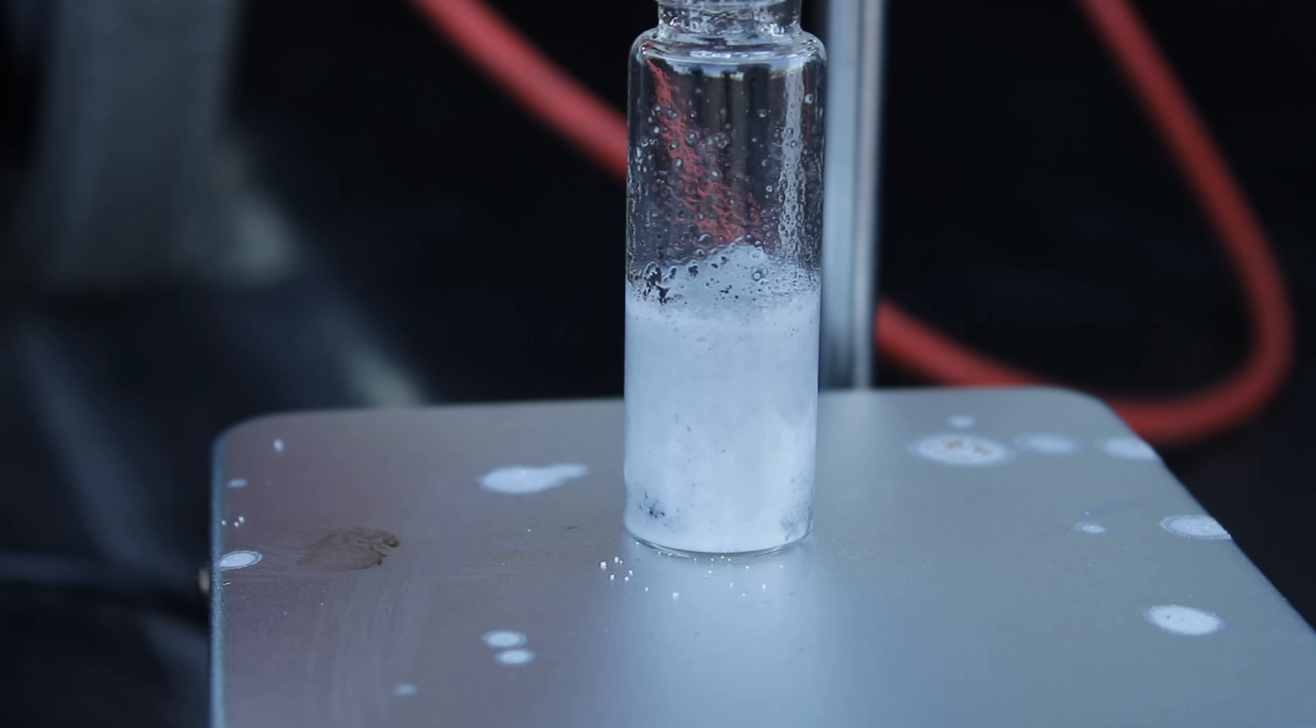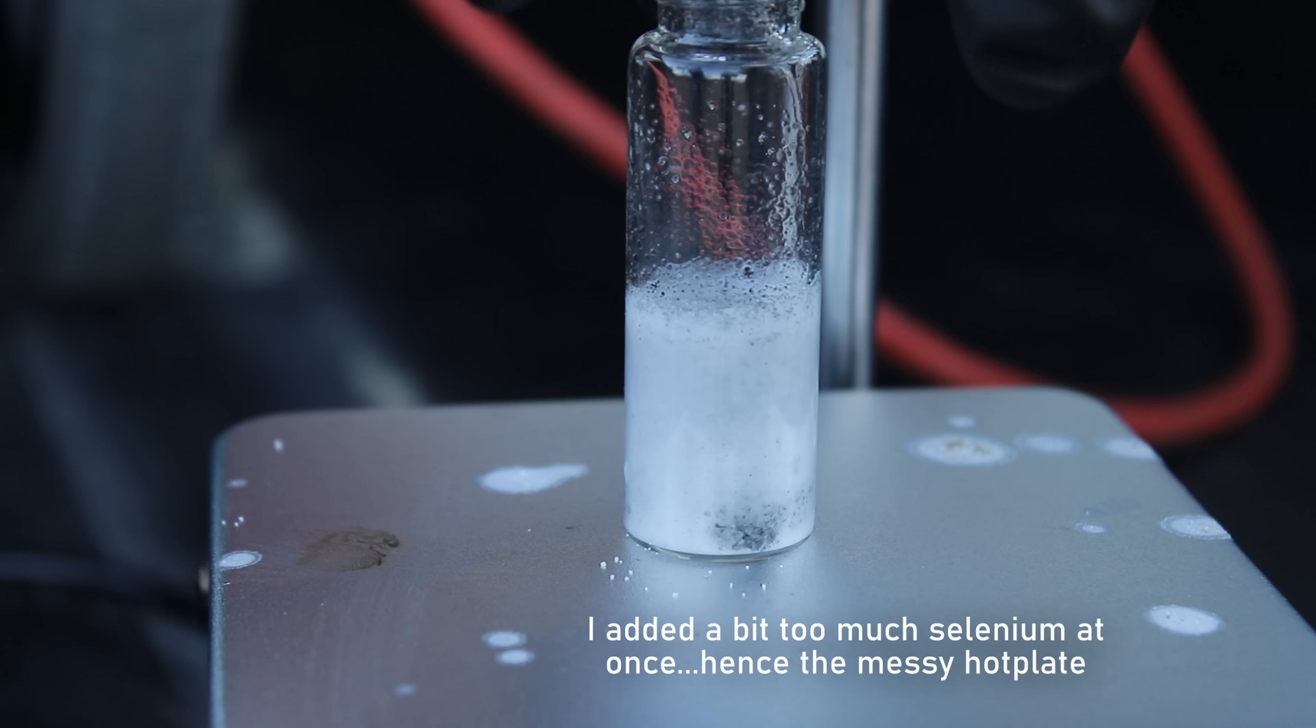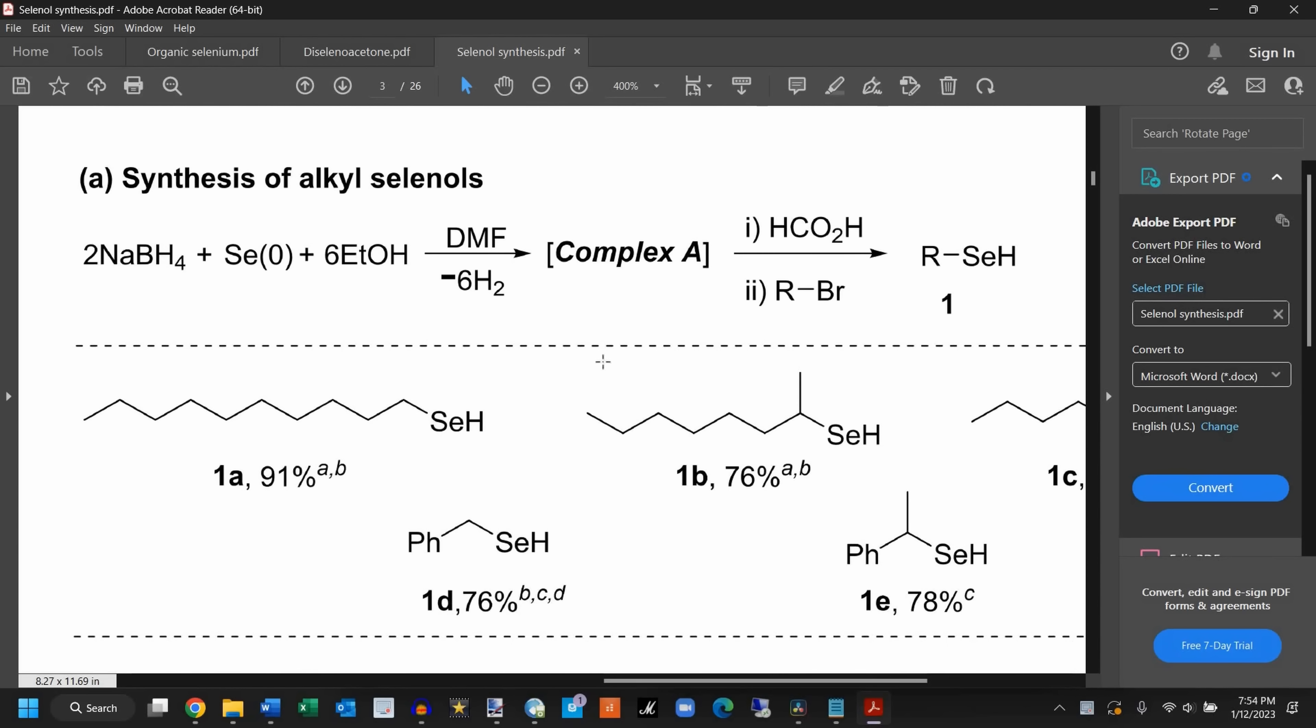You can see that my reaction mix got a little thick as more selenium was added, and this was because I didn't have enough solvent present to keep the sodium hydroselenide dissolved. The authors of the selenol paper actually recommended using an additional solvent, called dimethylformamide, or DMF, which complexes with the hydroselenide. This probably would have given a better result and a smoother reaction, but I didn't have any DMF at the time.